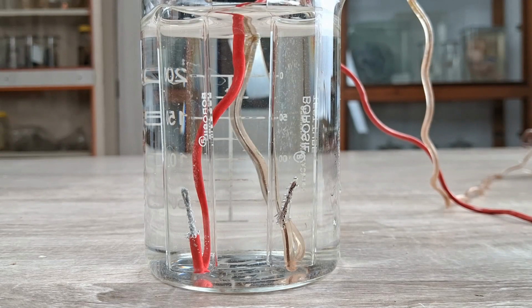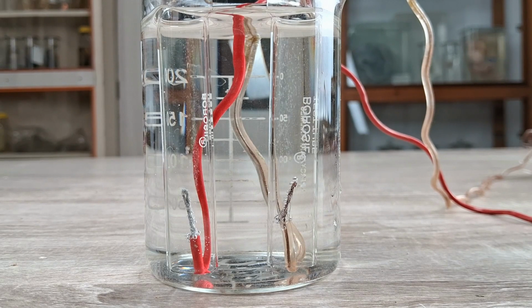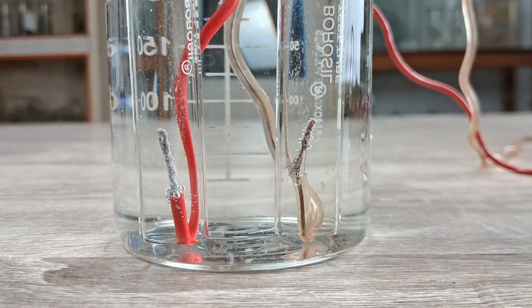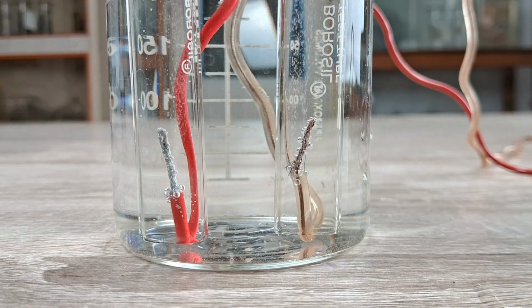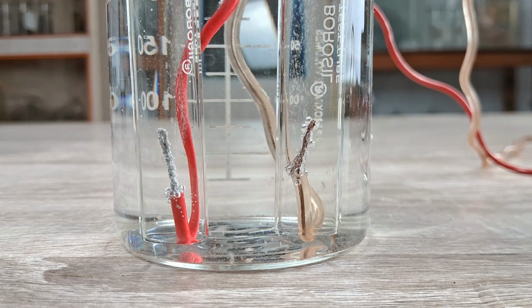When the electrolysis setup is connected to the power supply, you can almost immediately start to notice tiny gas bubbles originating from the exposed ends of the wires. On closer inspection, you'll also notice that the gas bubbles are formed more vigorously and at a faster rate in the wire connected to the negative terminal or cathode of the battery, as compared to the wire connected to the positive terminal or the anode.